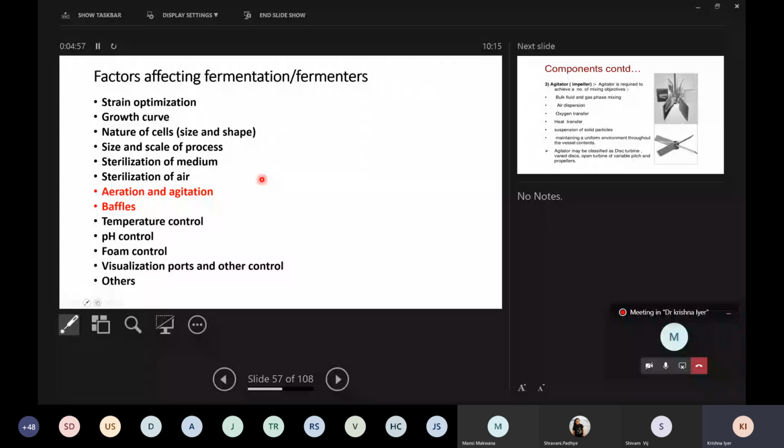organism: metals, ions, micronutrients. They go correctly into the organism, so the organism can take them up and use them to grow comfortably and nicely, so that your yields are very high. So agitation of the medium is a common feature whether the fermentation is aerobic or anaerobic. But given that the fermentation is aerobic, then another aspect also comes in, that you need to do aeration.